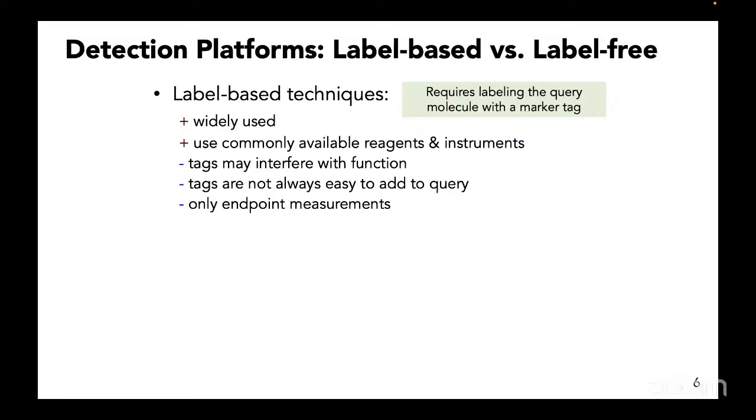Forget the time it takes to make the arrays, which is very cumbersome. Even beyond that, once you have the chip and you are doing the experiment, it takes a good 1.5 to 2 days, starting from blocking to various types of incubation, and only then are we able to get any kind of readout, any kind of signal, as you have seen in the scanner.